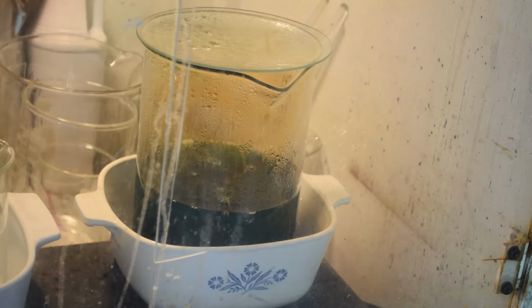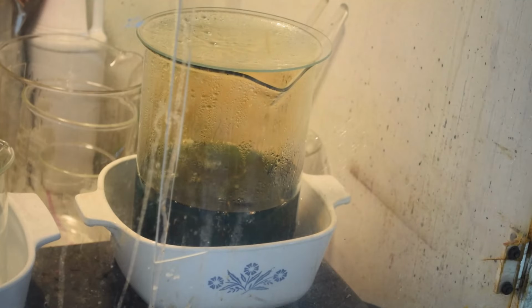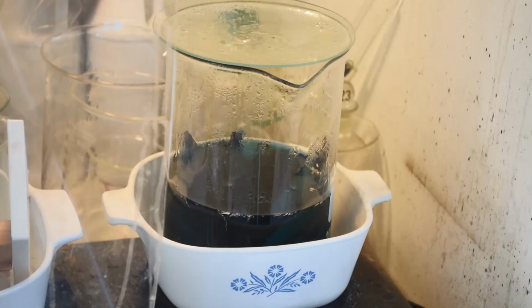But the reaction's still going. We're still getting fumes, even after, like I said, 20, 30 minutes. So I'm just going to let it continue to cook, and we'll deal with whatever we've got when the reaction subsides.